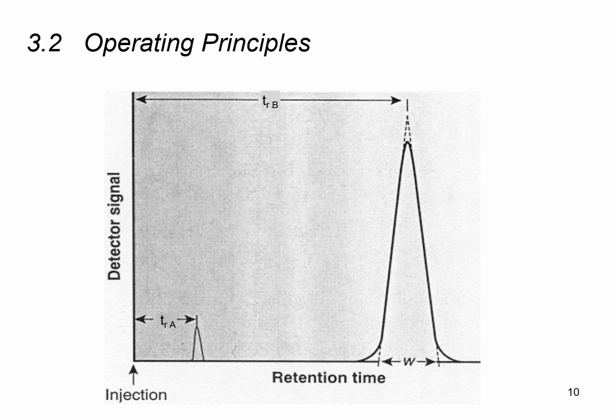So this is a very simple picture of a chromatogram. We actually see two peaks, one peak to the left, quite a small peak, and one peak to the right, quite a large peak. So these two values, TR subscript A and TR subscript B, actually represent the retention times of component A and component B. So clearly the retention time for component A is much smaller, so therefore it's coming out of the column much faster as compared to component B.